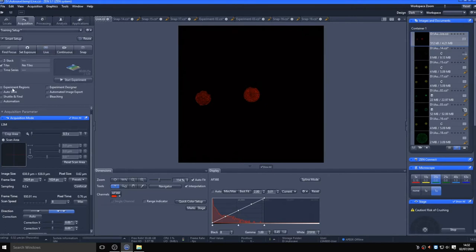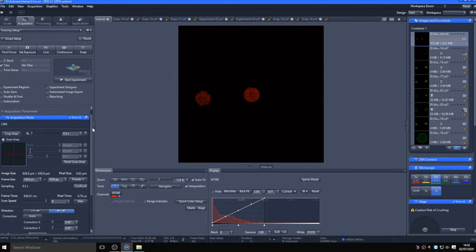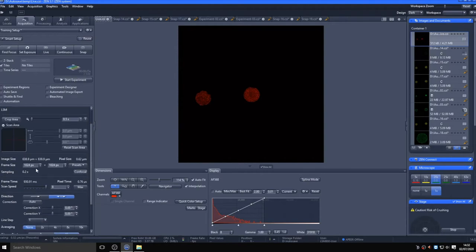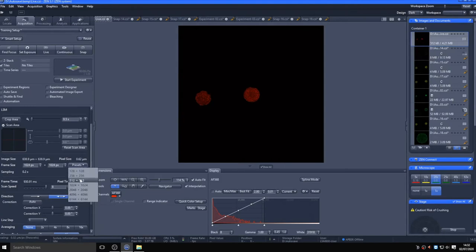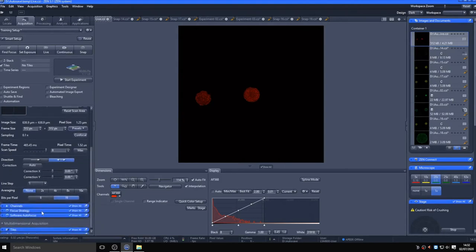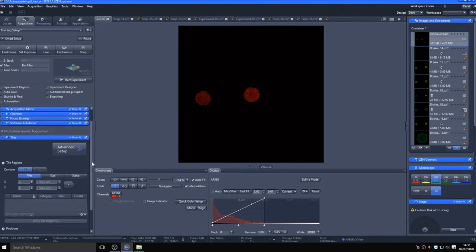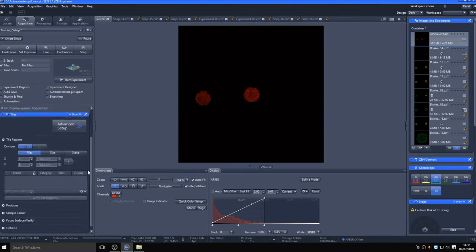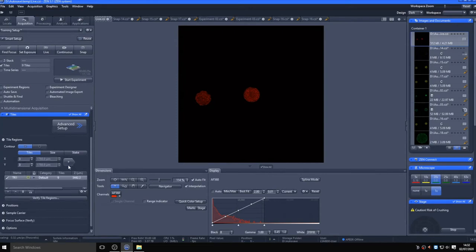To perform a quick overview tile scan of the area surrounding the current field of view, activate the tiles option. In acquisition mode, ensure the field area is zoomed out to 0.5x and drop the frame size to 512 by 512 with no averaging. Now, in the tiles tab, choose the area size you would like to scan. 3 by 3 is default, which is what I'll use here. Click the plus button to add this 3 by 3 tiled area centered on the current field of view to the task list.